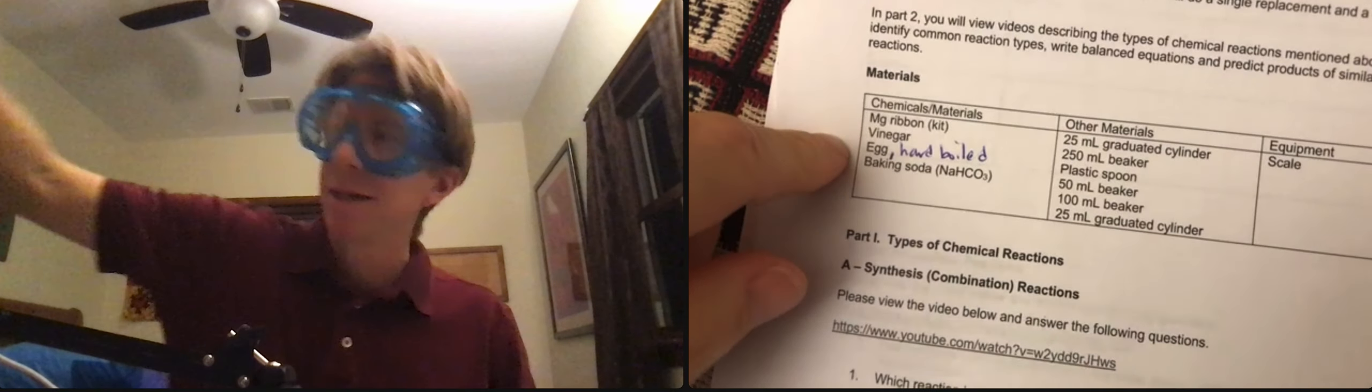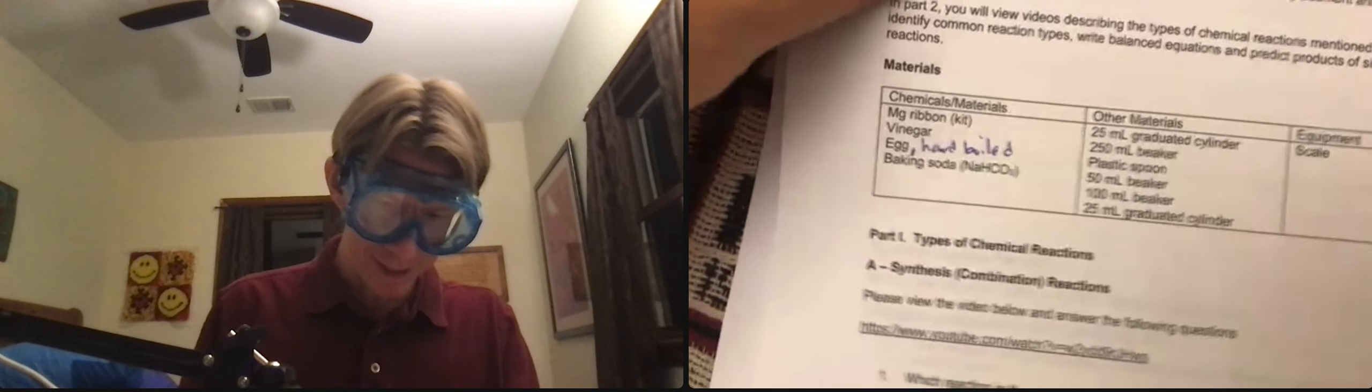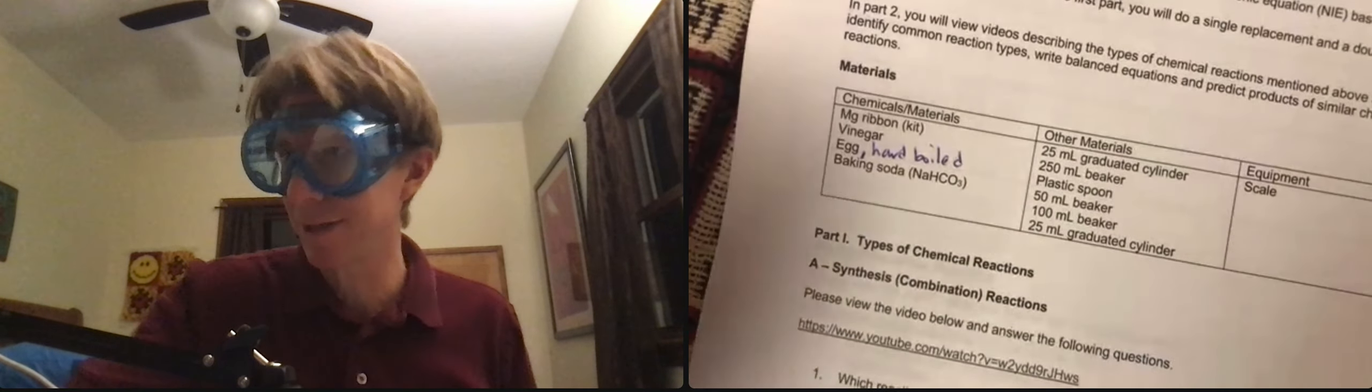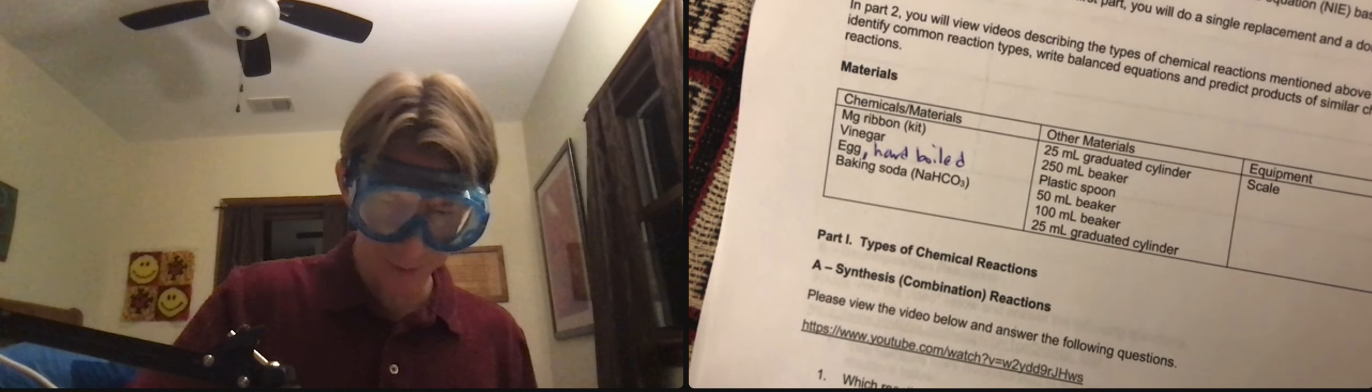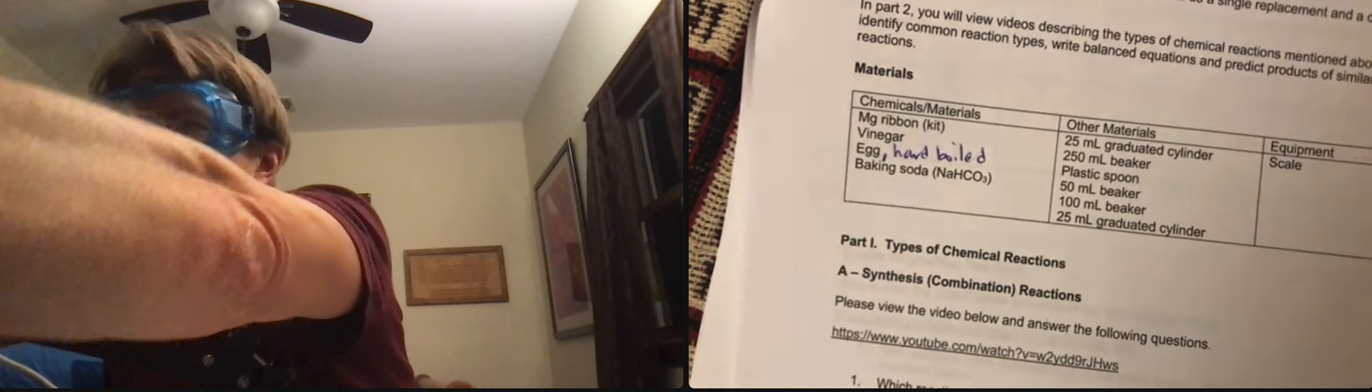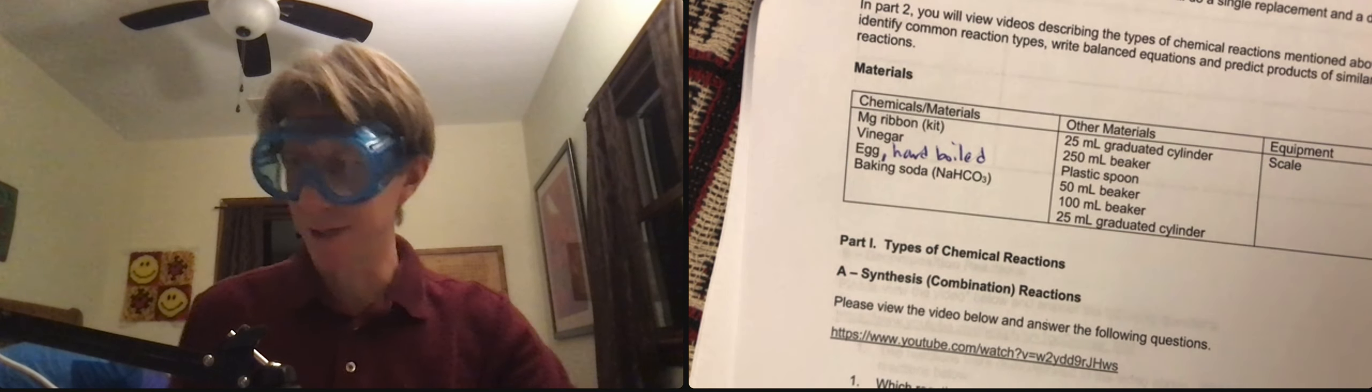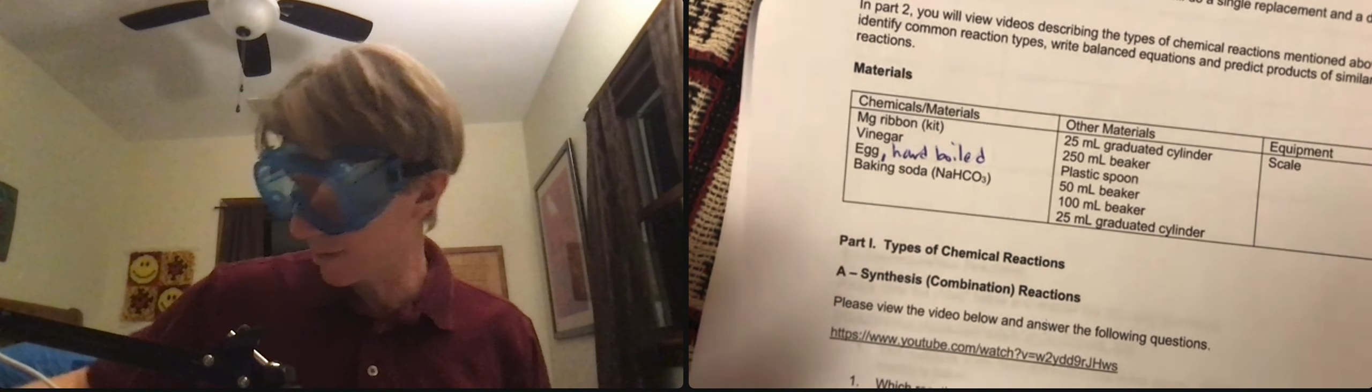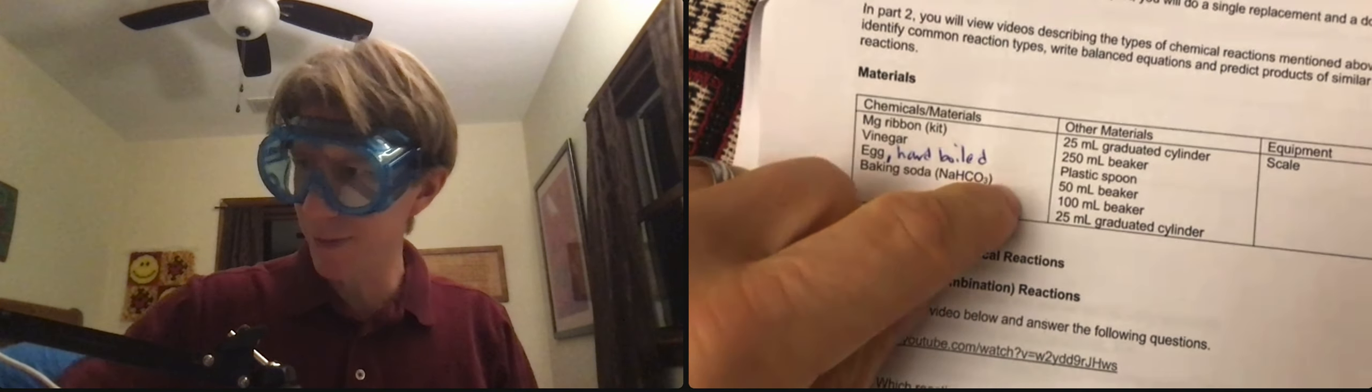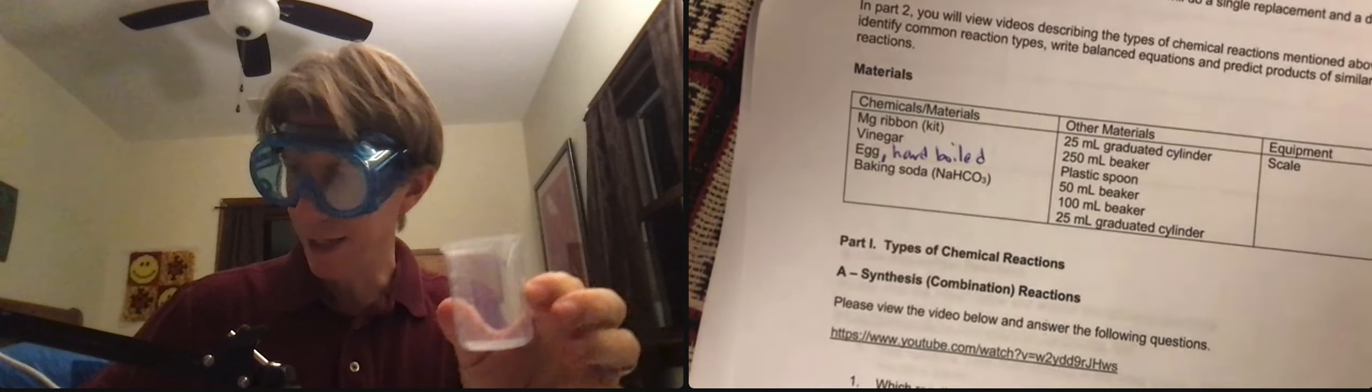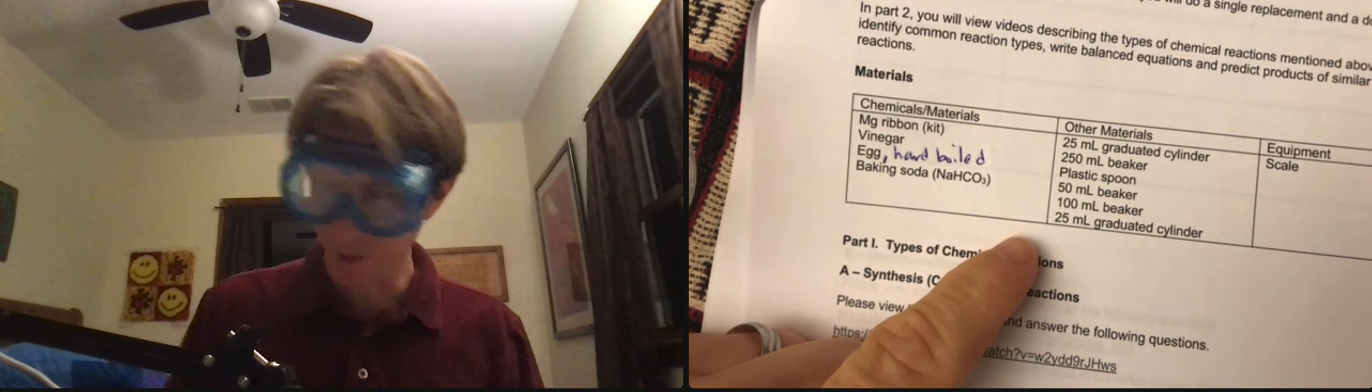Baking soda - any baking soda will do. I've got your typical Arm and Hammer. 25 milliliter graduated cylinder. My 25 milliliter graduated cylinder already has my five mils of vinegar in it because I know what's coming. A 250 milliliter beaker, clean and dry. A plastic spoon, same plastic spoon as last time. A 50 milliliter beaker, a 100 milliliter beaker, and a 25. We only need one of them.